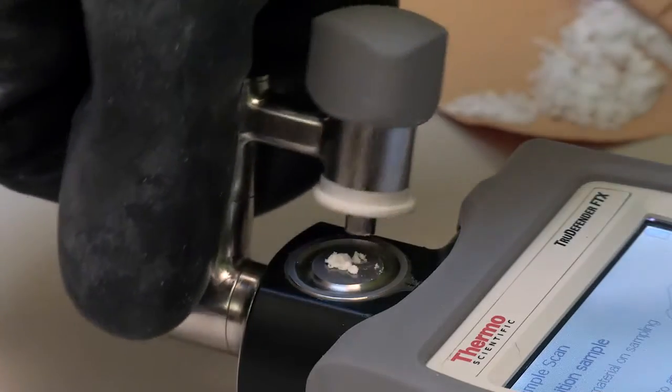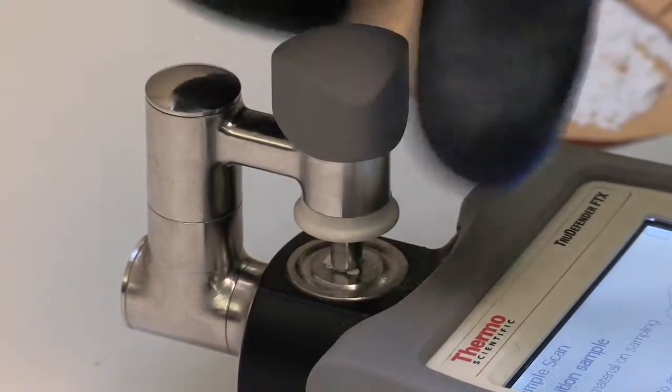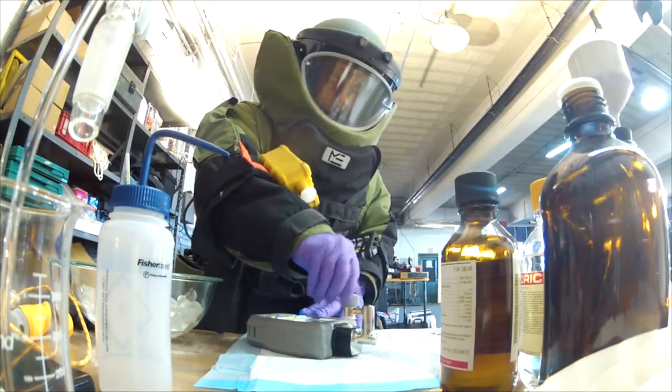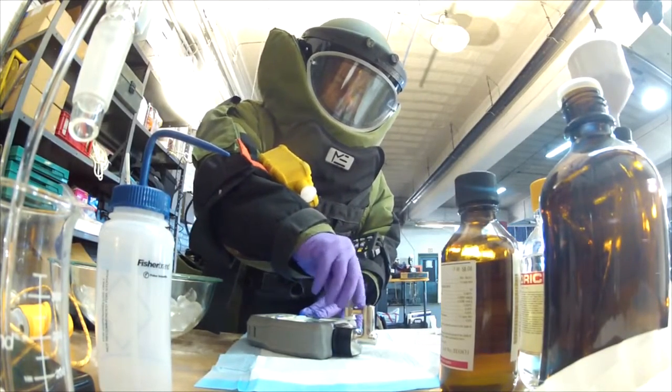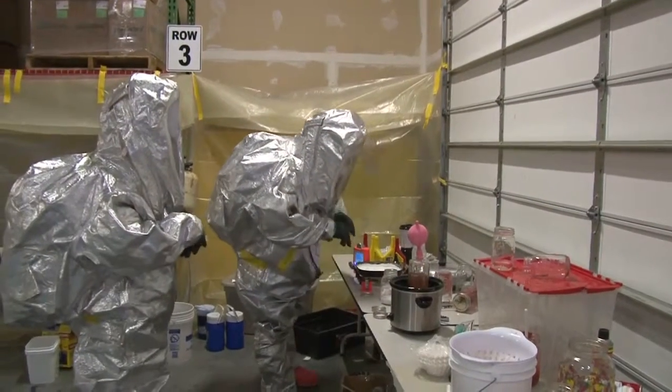The variable pressure knob allows users to apply the correct amount of pressure for a given sample. For EOD technicians, this may be less pressure to minimize risk, while for hazmat technicians testing a variety of unknowns, the True Defender FTX anvil enables increased pressure for sampling harder substances.